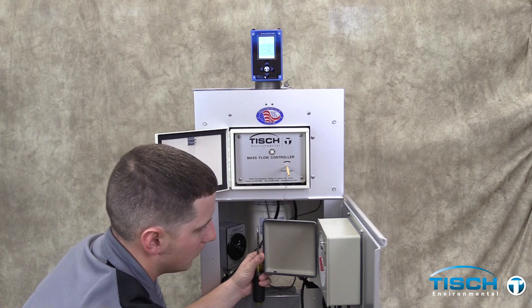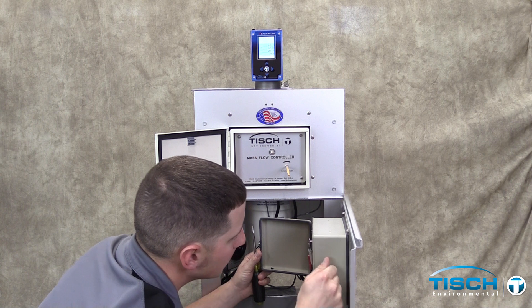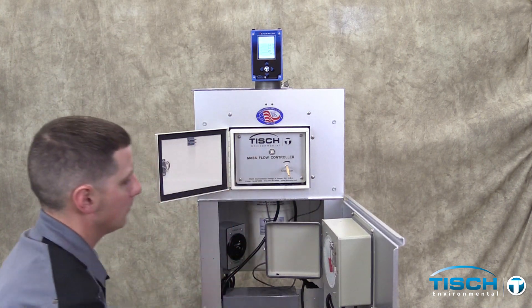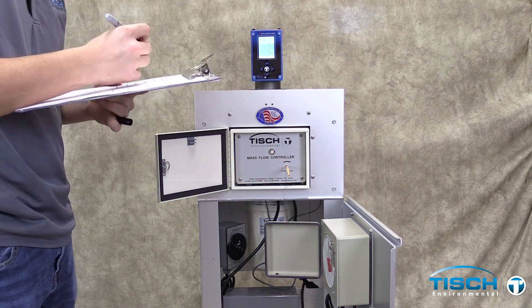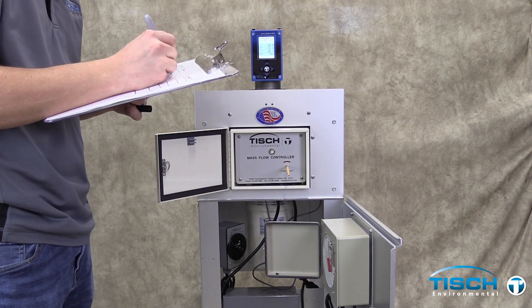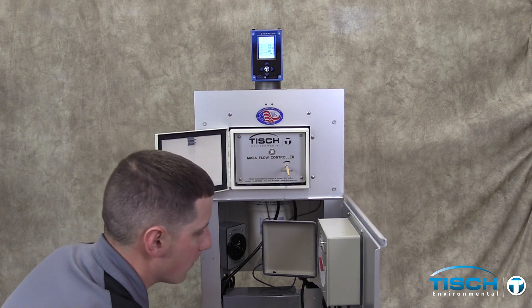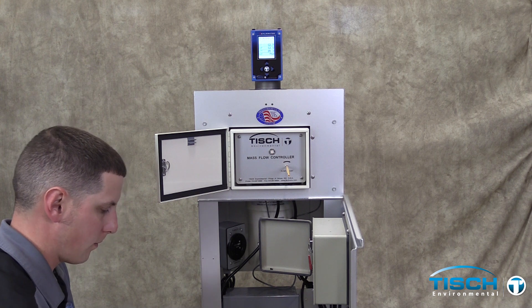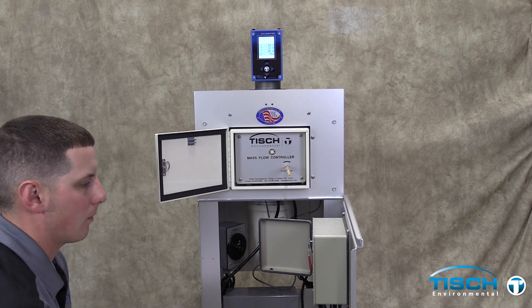Record the recorder chart reading and record the Q-Ambient reading from the calibrator. Repeat the steps to get five different readings. Turn the flow controller down for each reading, turning the screwdriver counter-clockwise to slow down the motor for each point.